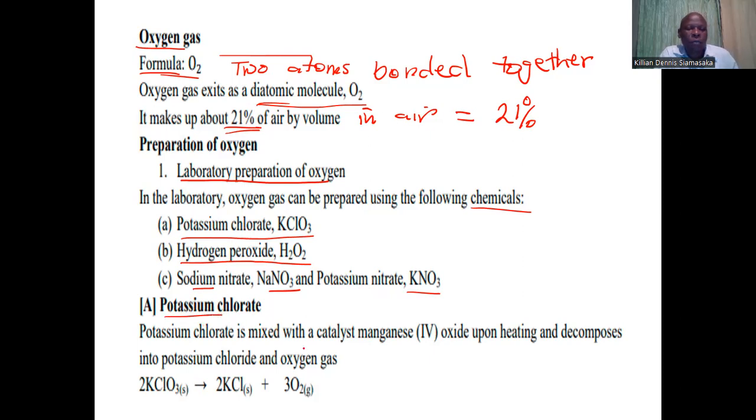Potassium chlorate, when it decomposes, requires the use of a catalyst known as manganese IV oxide. Manganese IV oxide reduces the activation energy.